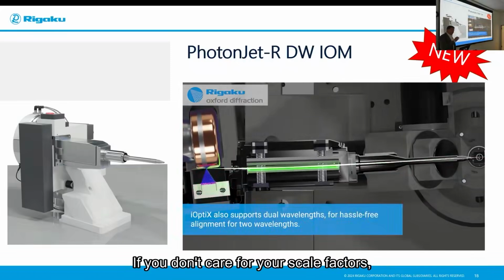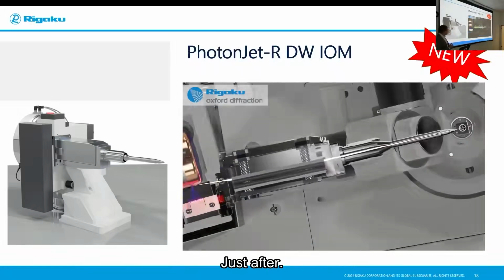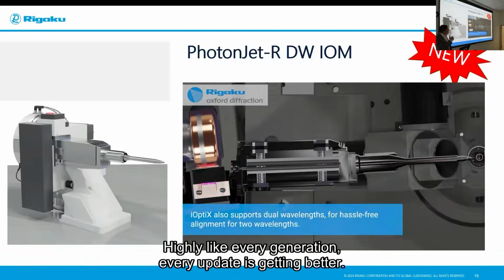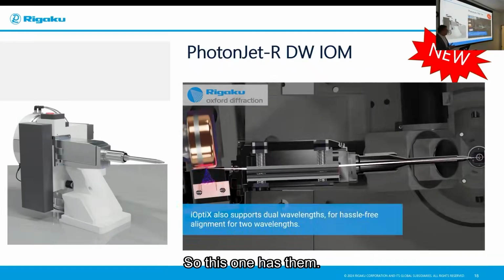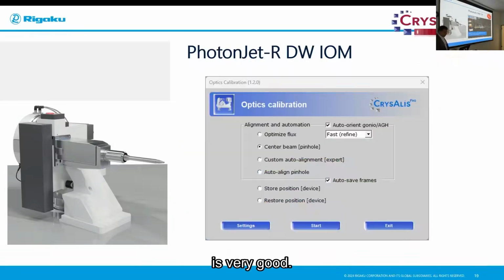So if you don't care about your scale factors, you can just continue measurements instantly just after. So that's highly improved, like every generation, every upgrade is getting better, as you can see, with fewer screws, fewer knobs. So this one has nothing that the user can touch. Everything is software controlled in this version.